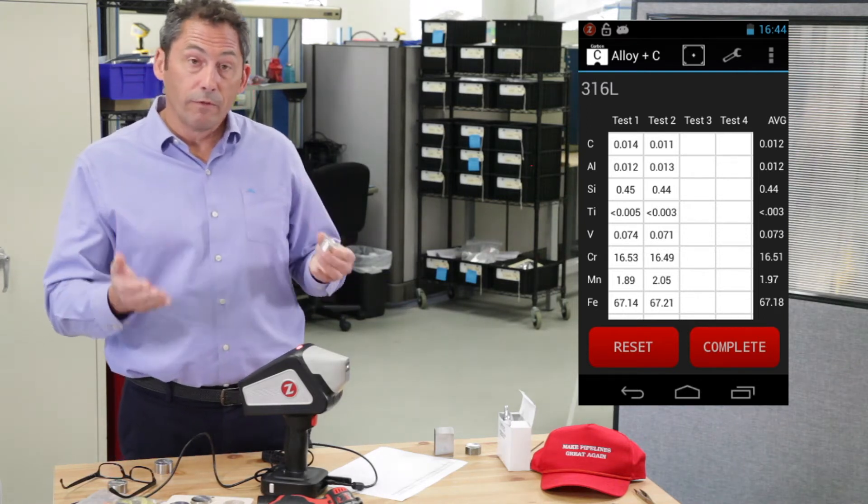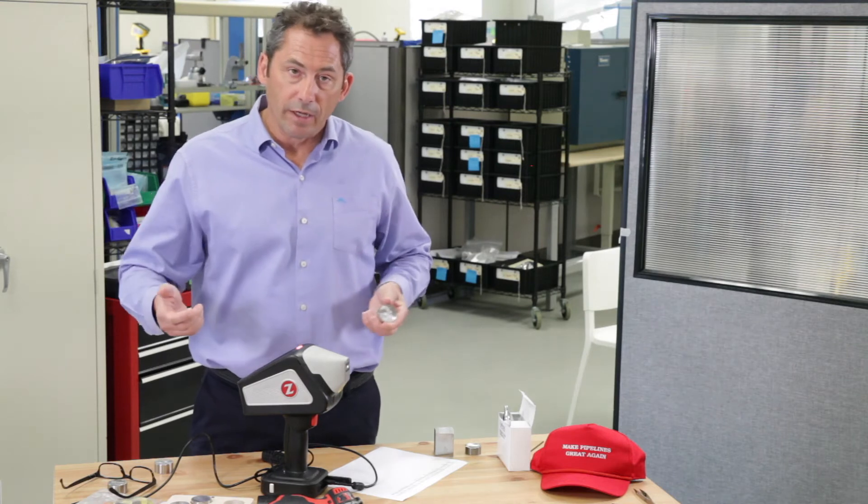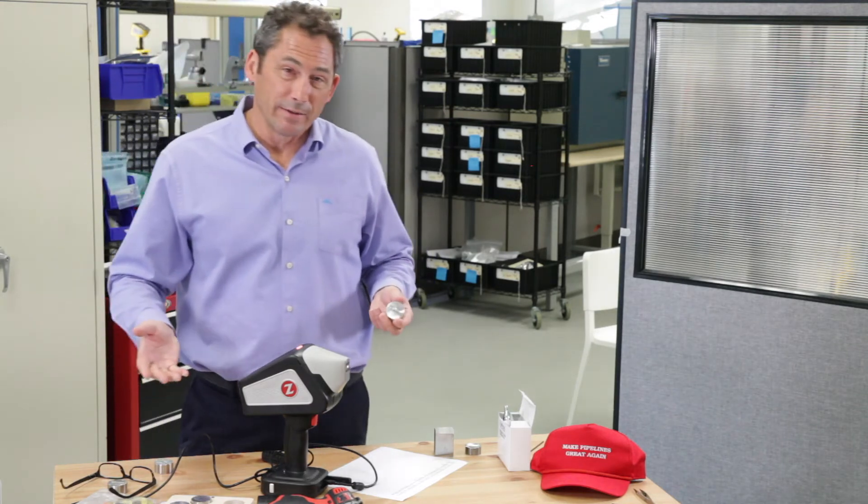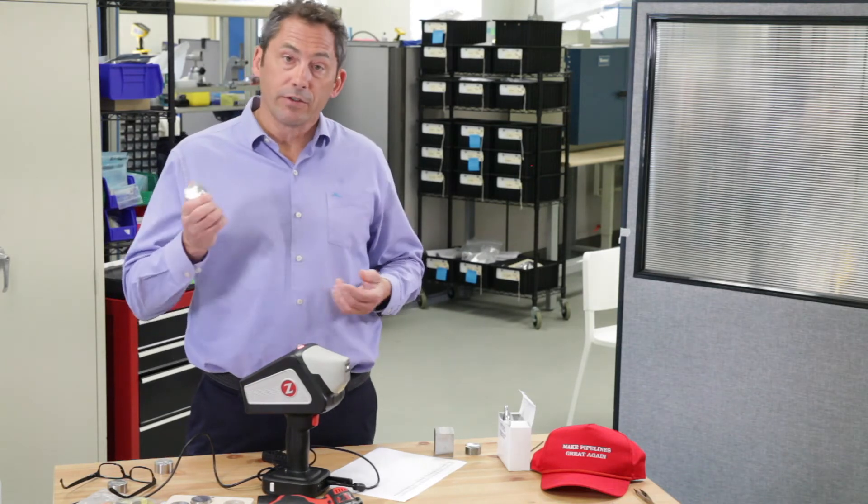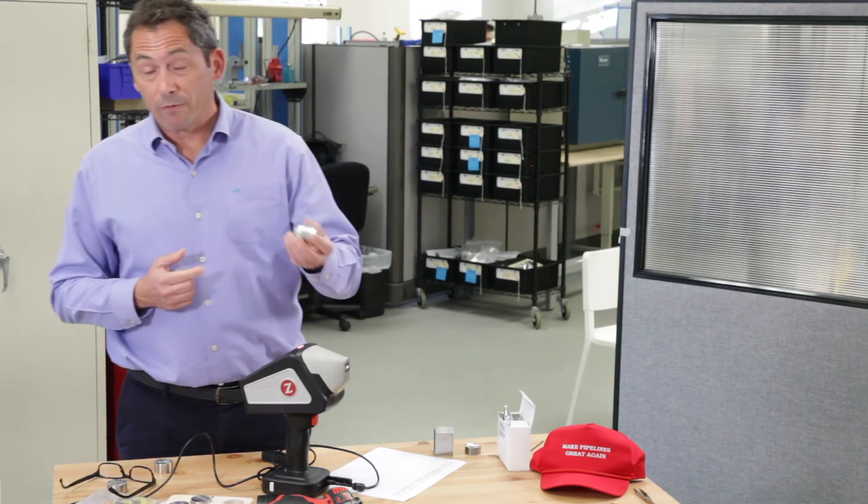And so there's two advantages there. One is speed. They're done in, like, 10, 12 seconds instead of 20. That's good, especially on a hot day in Houston. Second advantage is argon consumption. If you're only running a couple of burns instead of four or five burns, you use roughly half as much argon.